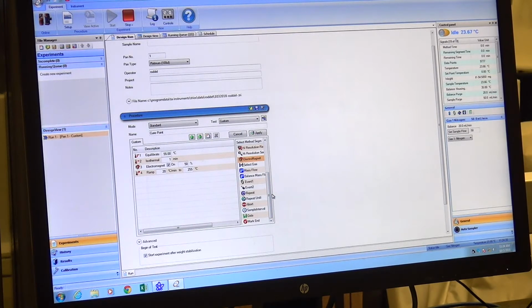Like, so when you ramp up to, let's say, 700 degrees Celsius, yeah. Now you want to cool it down. Is there any command for cooling down? Yeah, so the ramp command controls both heating and cooling. It just depends on what your final number is.